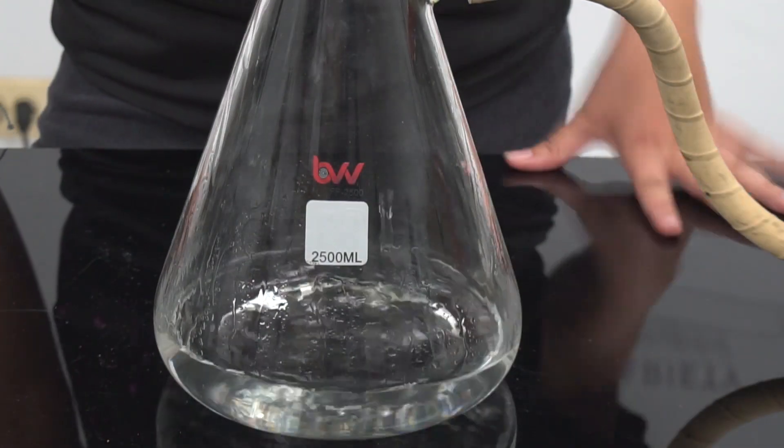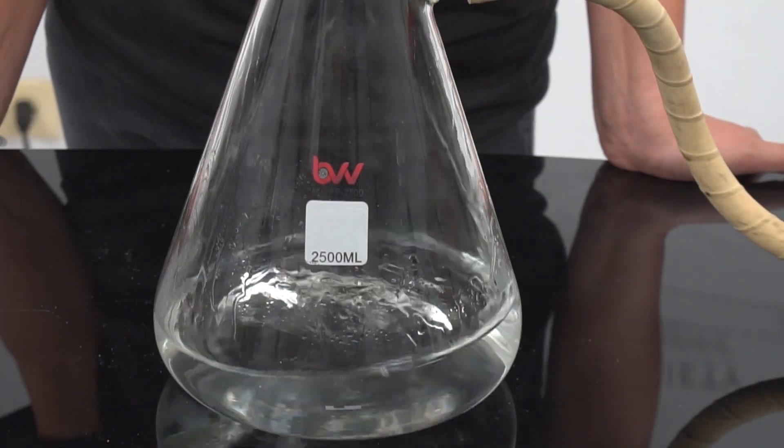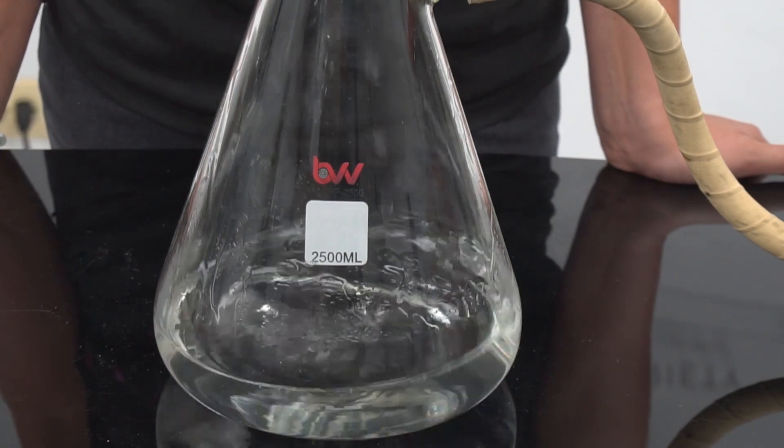As you can see, the particles are being filtered out and the solution is coming out clear. For different particle sizes, we offer different filter paper sizes.